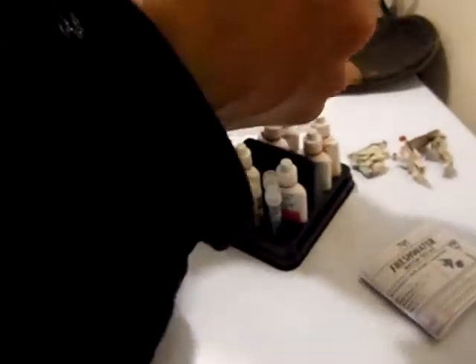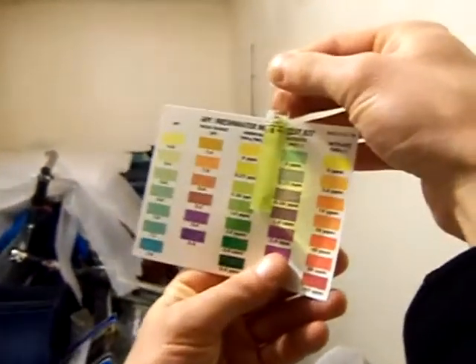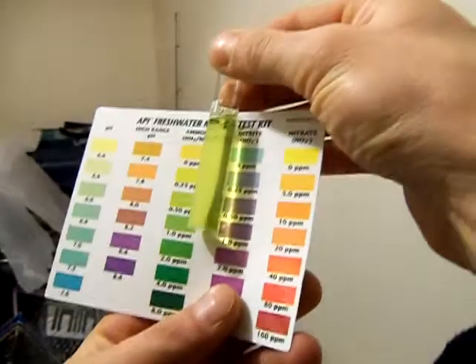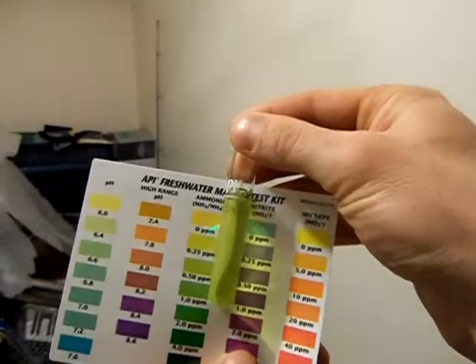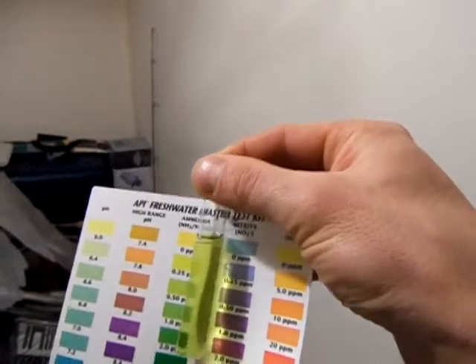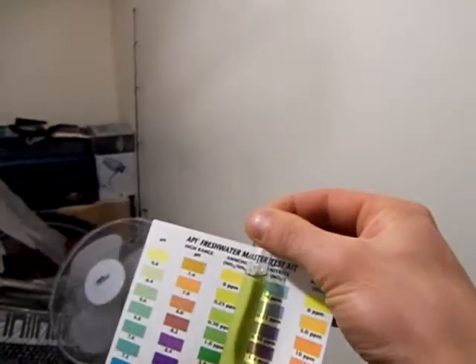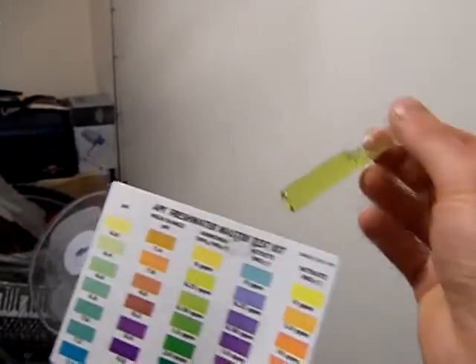So this one will be ammonia. About 0.25 parts per million — maybe 0.25, I think. Okay, so we were at 0.75 for the city water. So overnight it's come down, which is pretty good.